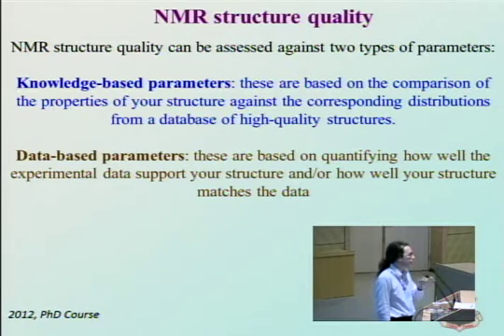And you can do the same for various properties. You can take the number of hydrogen bonds, or you can take the density of your protein, the tightness of packing. We will have a look now.